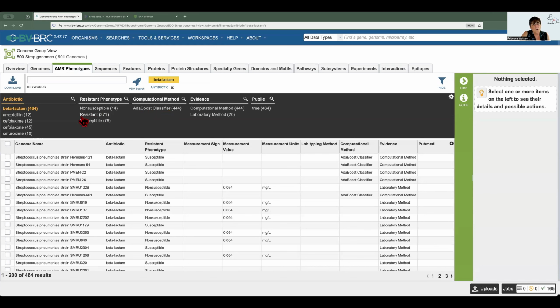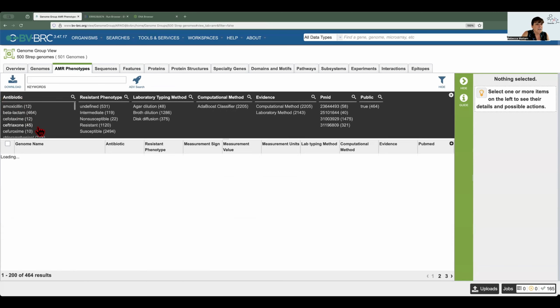But moreover, resistance at 371, the tree building pipeline accepts up to 100 genomes. So this is going to be too much. Just for our example. Now if this is your data you're playing with, you're going to dig into those genomes. You're going to try to find ones that are good quality. You're going to be hitting it if you want it to do something similar. So I'm going to click that one off.